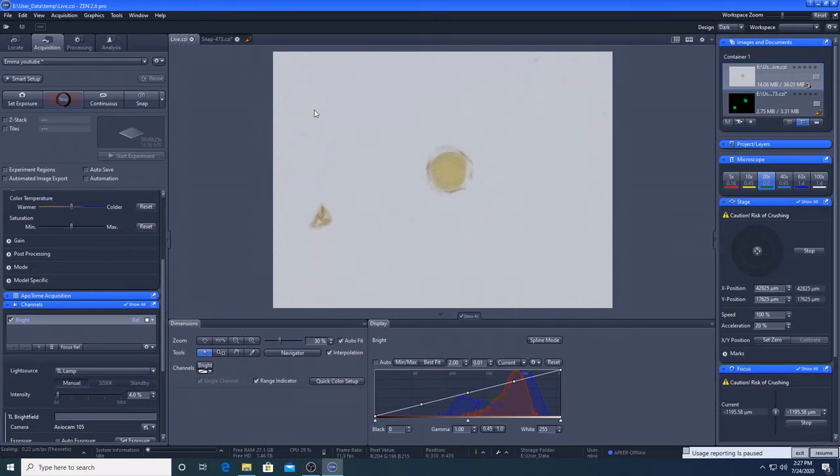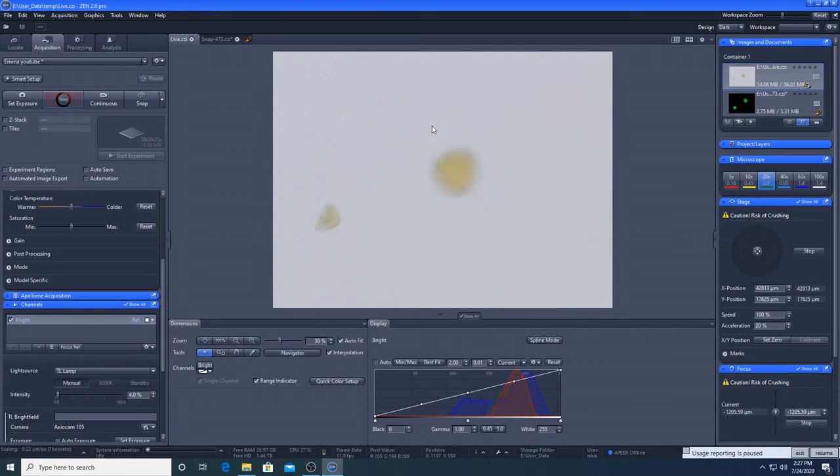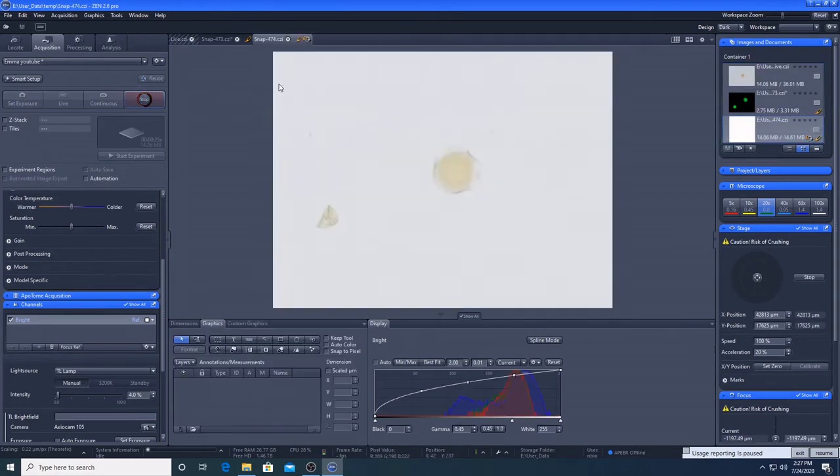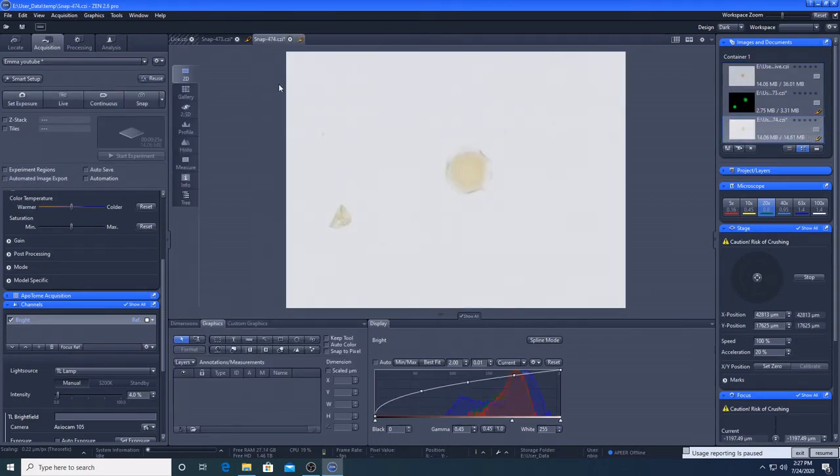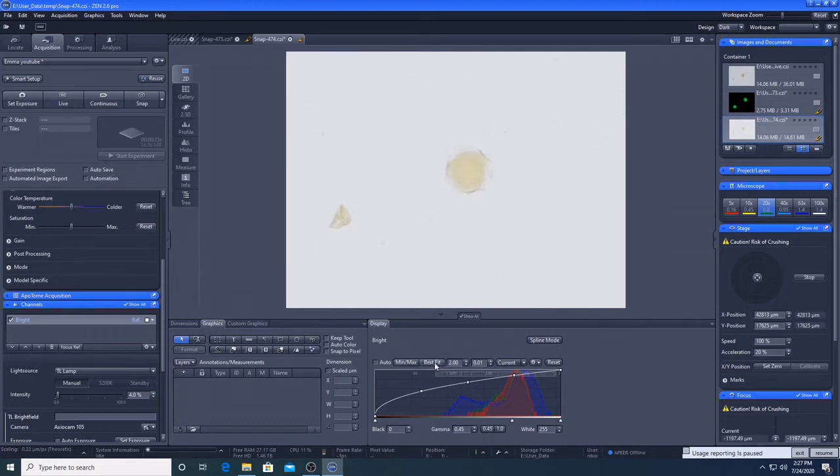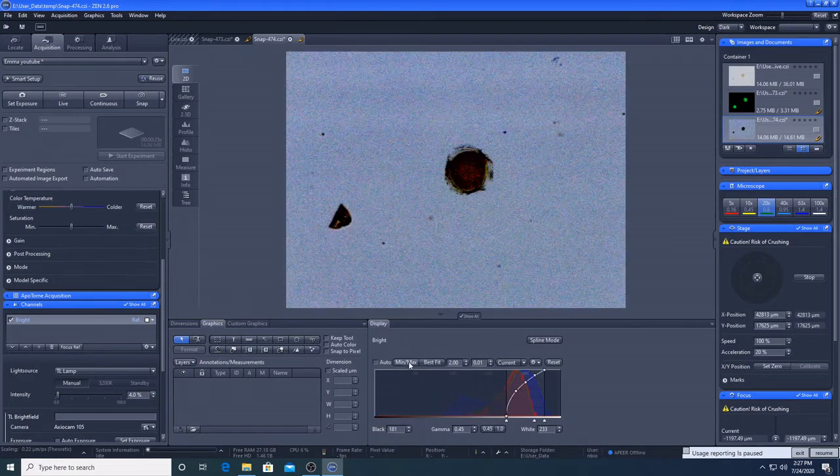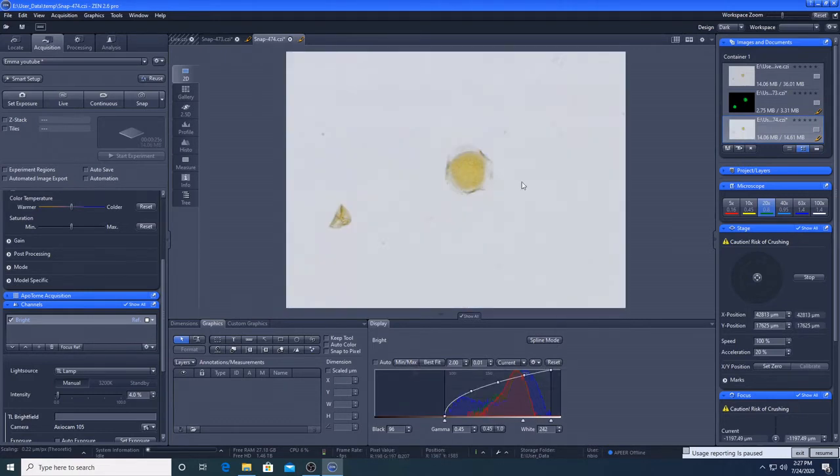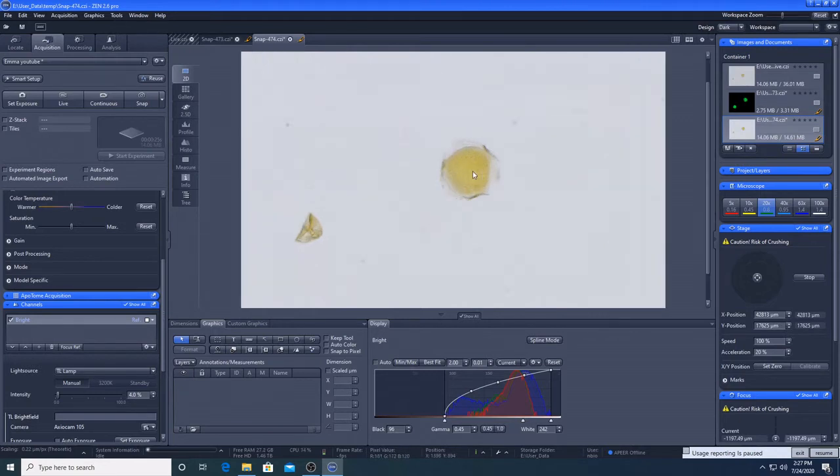We can see that the image is slightly better. So let's take a snap. Let's see how that looks. That's not too bad. I press min-max. It makes it look, it gives it a slightly more contrast.